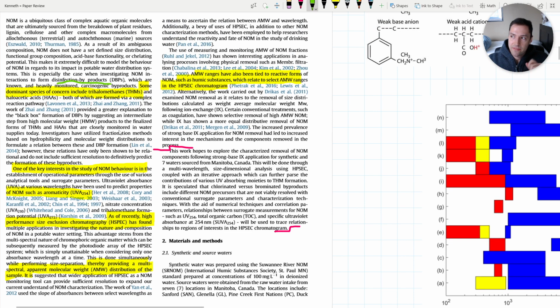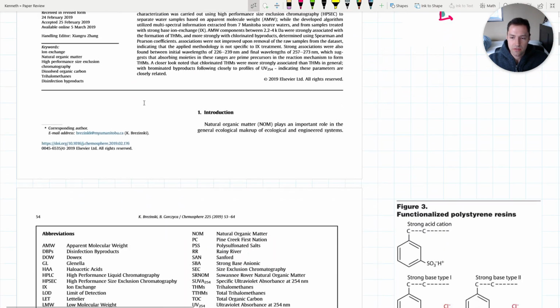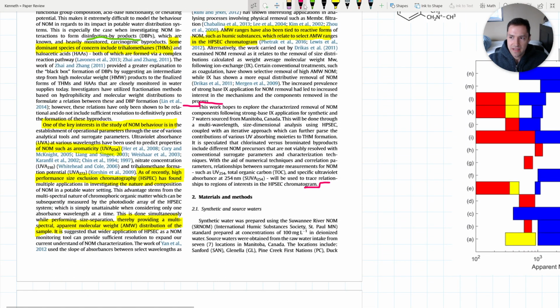And the thing is, they're very carbon-based, nitrogen-based, oxygen-based, mainly aromatic carbons. And what we find is that these aromatic carbons are very reactive. And that's why it says via a complex reaction pathway. It's because when you're working with these compounds that aren't very well characterized, and you're treating with chlorine, you have so many things going on, it's very hard to know exactly what's going to happen in the future.